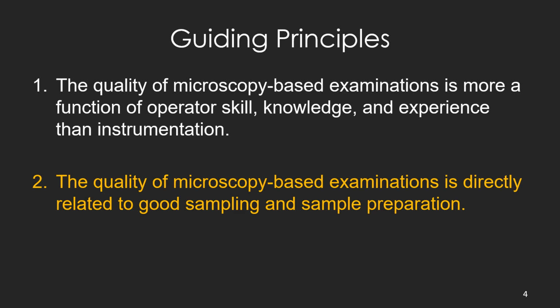The other thing is you have to be able to sample well, and with contaminant identification, it's just crucial that you do good sampling, and that's not a trivial subject at all. I'm going to try to cover that in some detail in these upcoming videos.